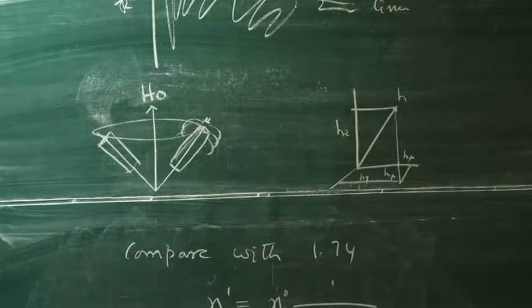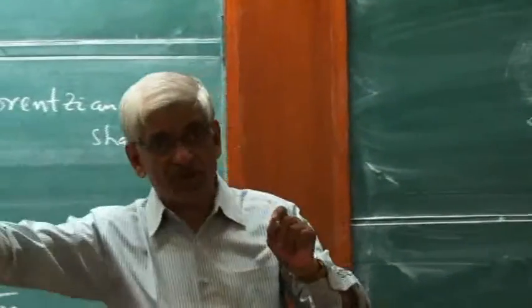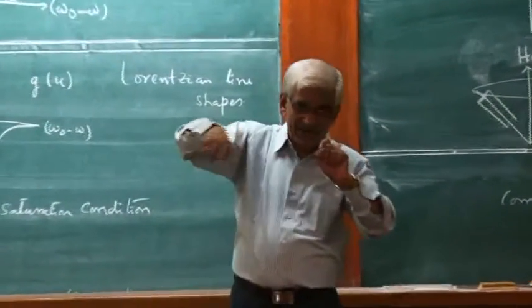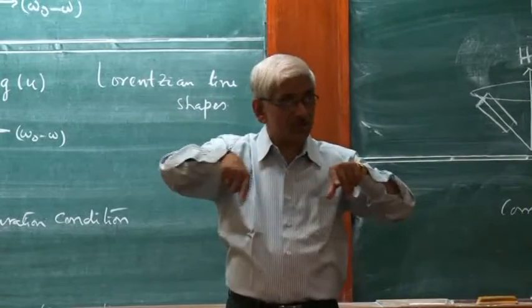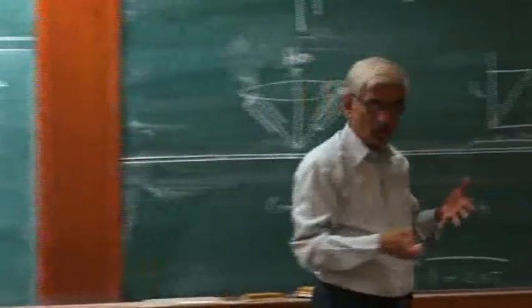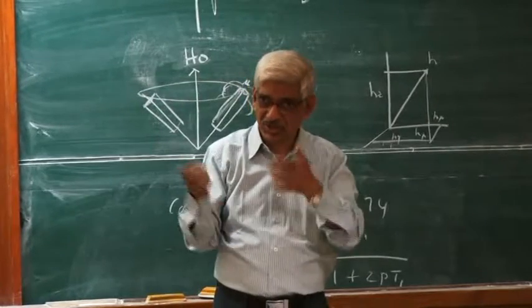And the Z component does not depend upon time. Well, it does depend upon time in a different sense. The magnitude can be different if the spin moves away from the site of this spin. It will have a different Z component here. And always the X and Y components will keep changing because of the motion, because of the precession. And the X and Y components moving, they will contribute to the relaxation.